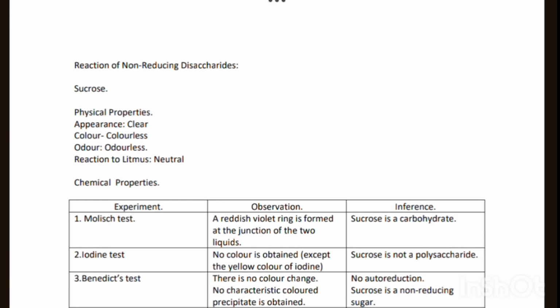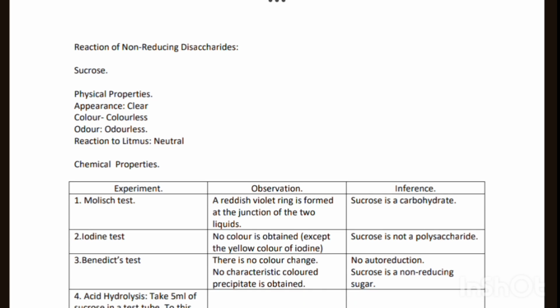Coming to reactions of non-reducing disaccharides, sucrose. This is very important because sucrose can come for the exam. Physical properties will be clear, colorless, odorless, neutral as the others.